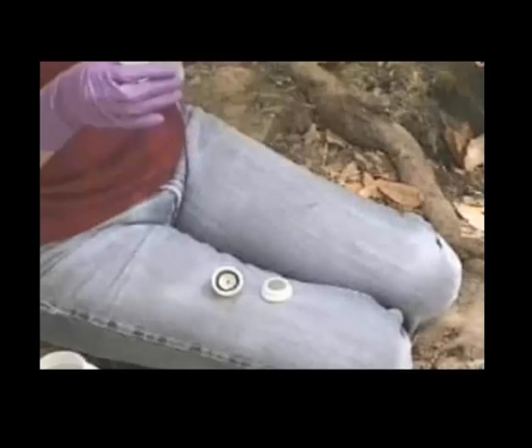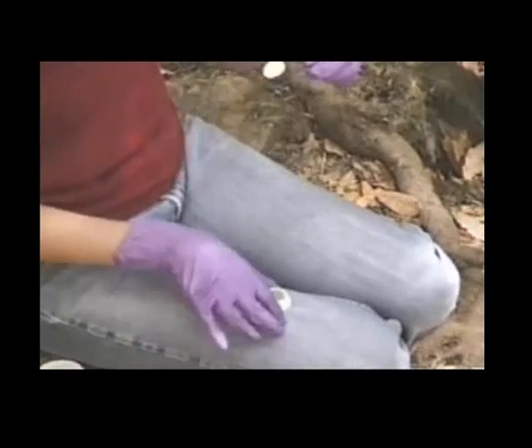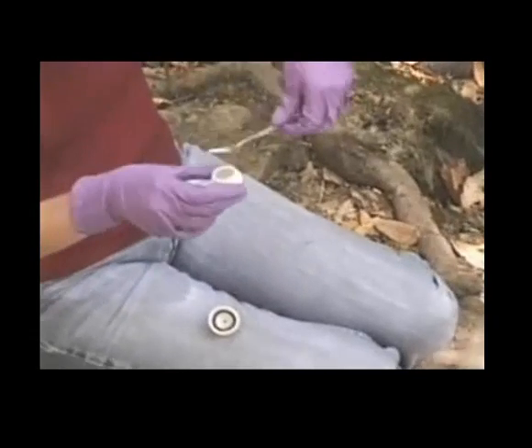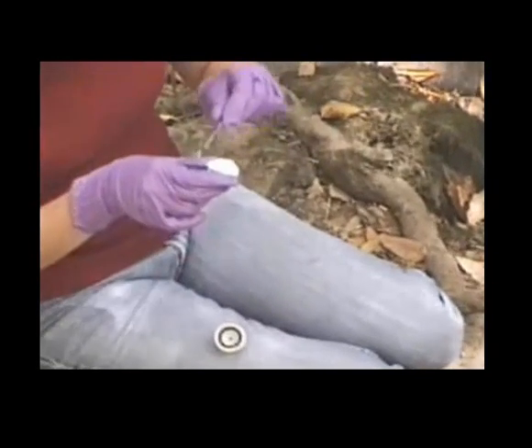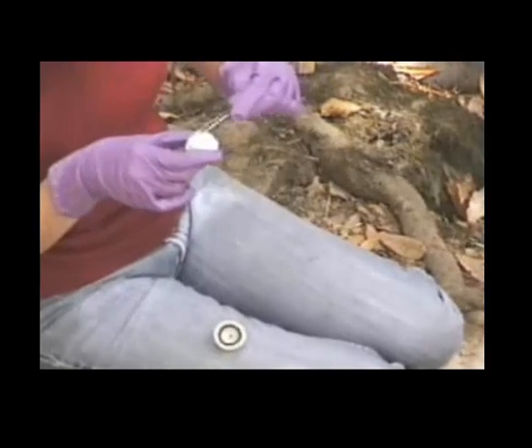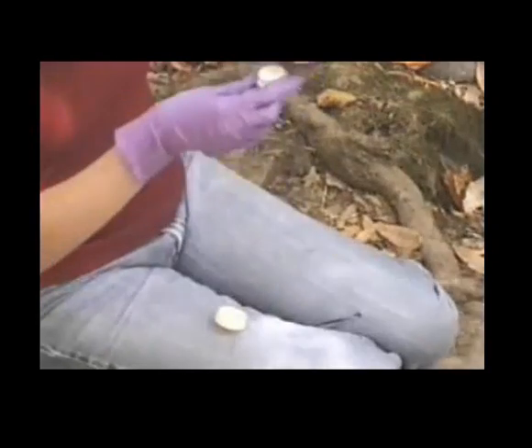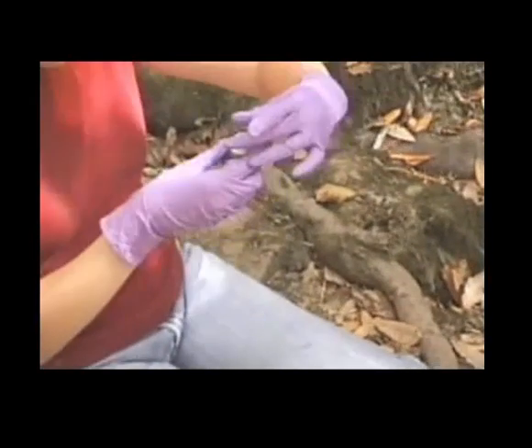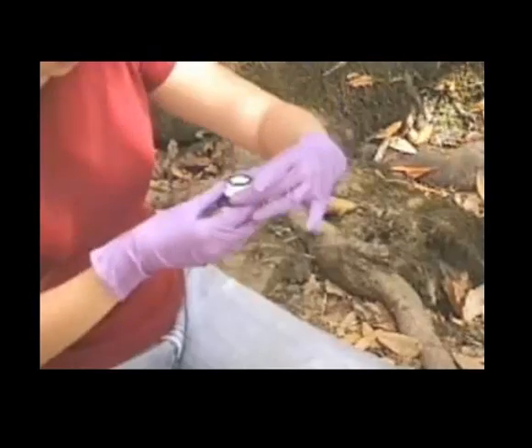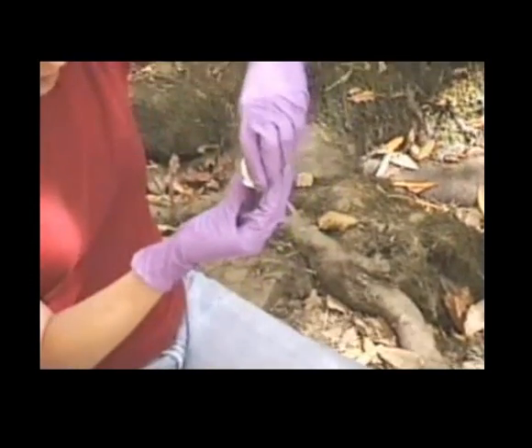You gently take the filter out with the forceps and place it in the exact center of the filter holder, making sure it's secure. Place the O-ring on top also so it's centered, so you can put the filter together.